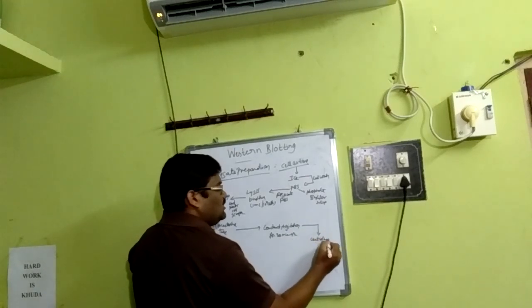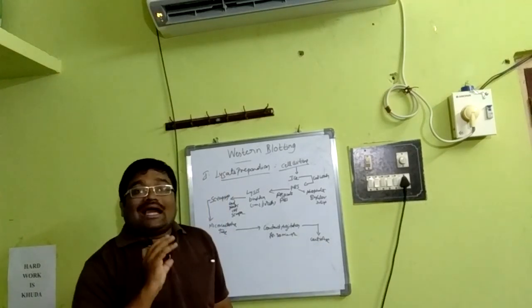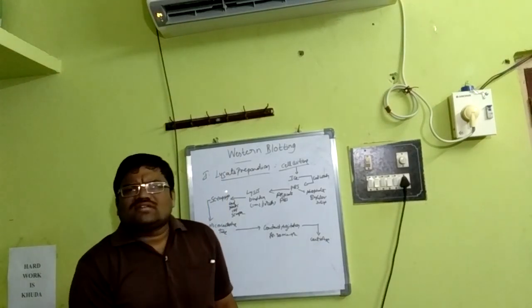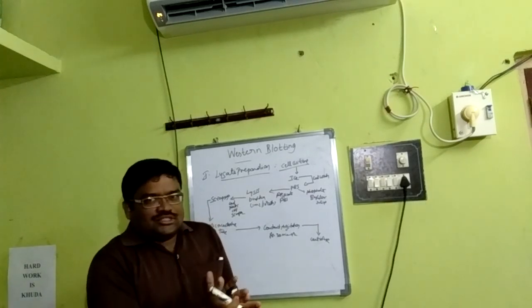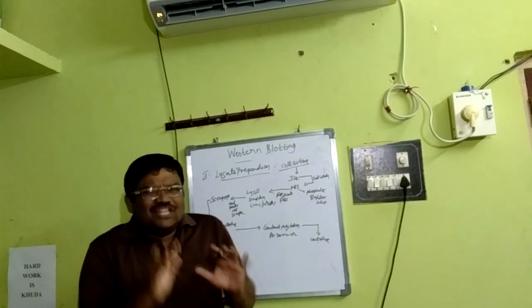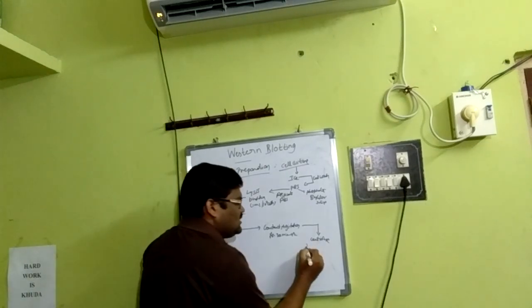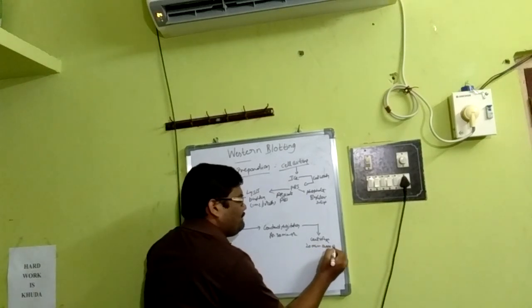This is very important. Generally, the centrifugation depends on the kind of cell. Say for example, leukocytes require light centrifugation. That means the centrifugal force and the centrifugal time depend on the kind of cell. In general, we say 20 minutes at 12,000 RPM.